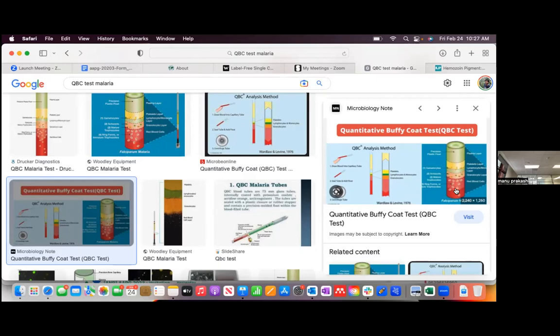So I'm going to take a step back now, but one of the things that I wanted to highlight is the idea that centrifugation is very powerful. It's used in all kinds of blood analysis. When you go get a urine test, when you get the majority of the blood tests, if you're getting any sets of samples that are heterogeneous, you can use centrifugation to separate them out.